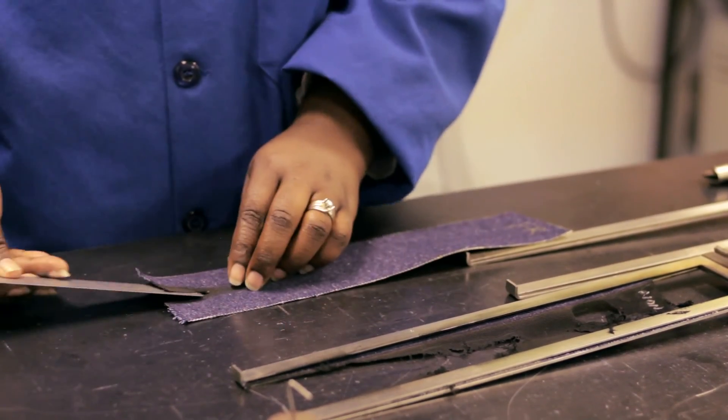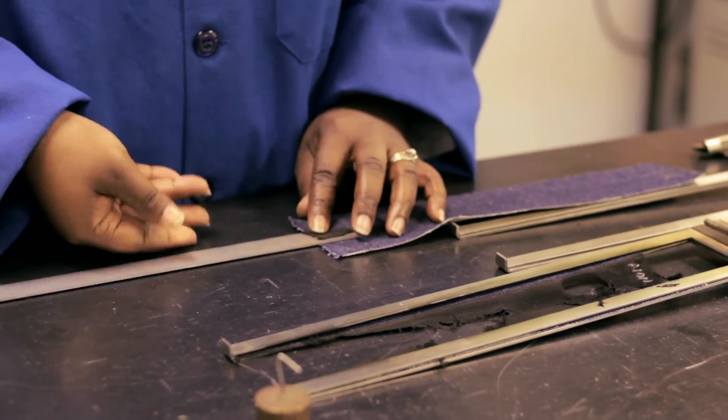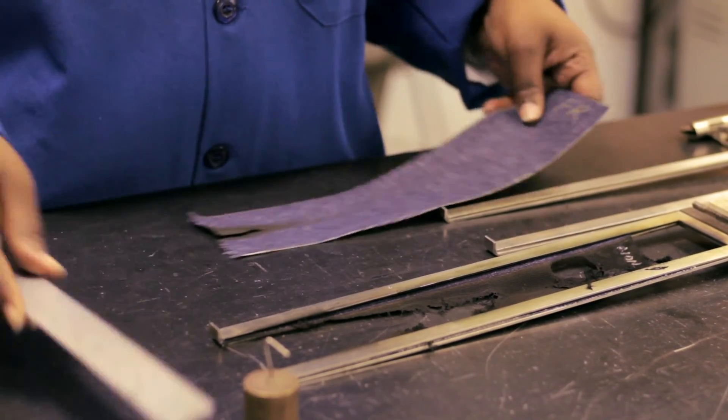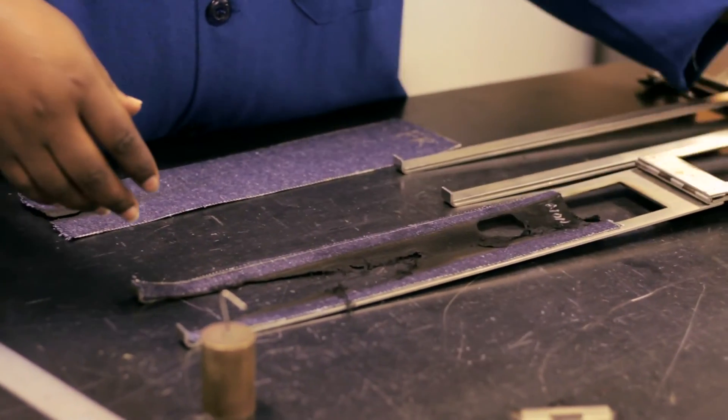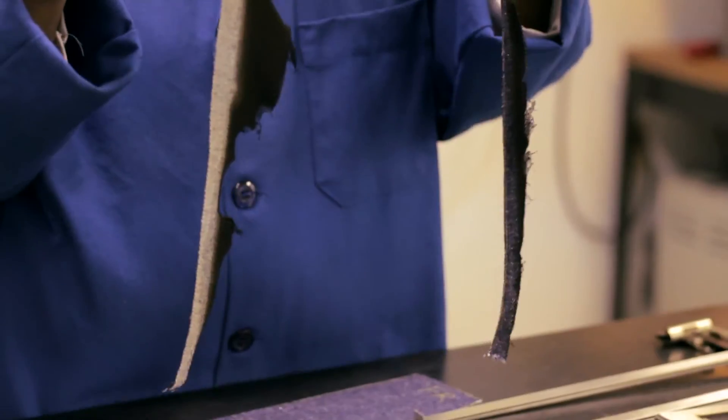Let's look at the denim samples first, starting with the FR-treated 100% cotton specimen. Acceptable. Now, the non-FR 100% cotton. Not acceptable.